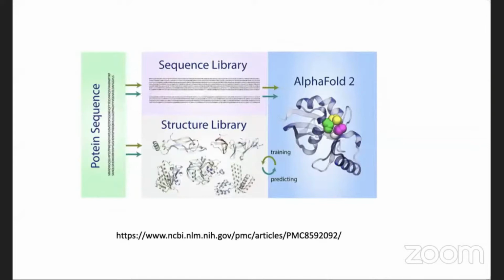If you have the software installed, it would be great to do this in sync, which would be to have at least Chimera installed. It's a visualization software, UCSF Chimera. If you're on Mac, you can use the X version, ChimeraX, which also has the capability to predict structure from the interface, incorporated in the Mac version. And there is the one we have on Windows, which we will also take a look at. I have both systems, Mac and Windows, so today I'm using two logins. In case you face any difficulties or have any questions, feel free to ask, independent of the platform.